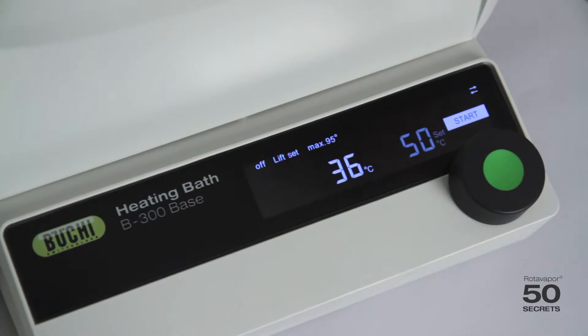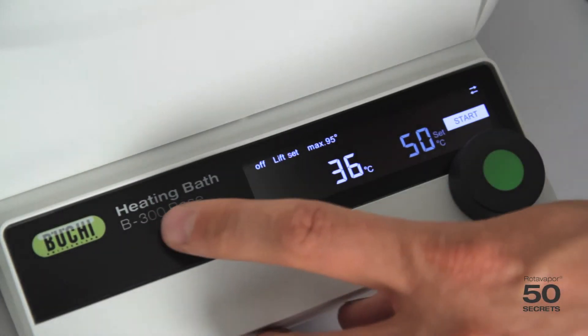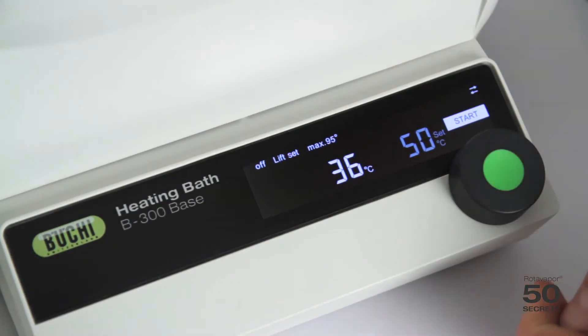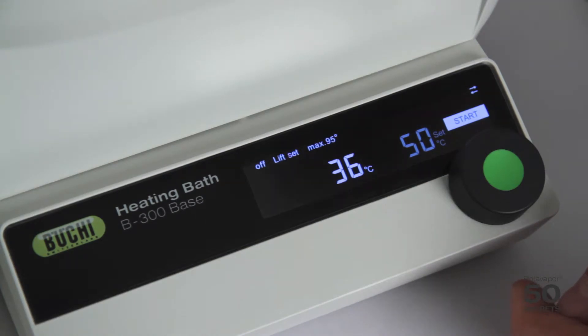This is about the heating bath of the R300. It's called heating bath B300, and this unit here is called the B300 base. I would like to show you some of the functions.